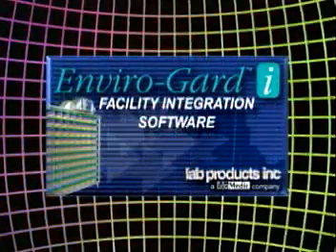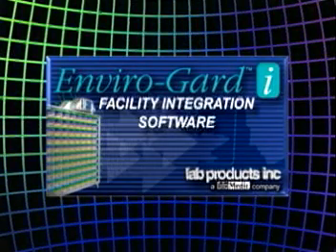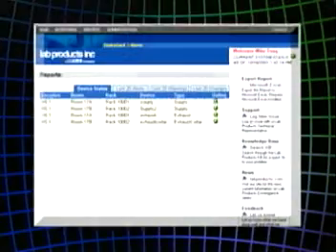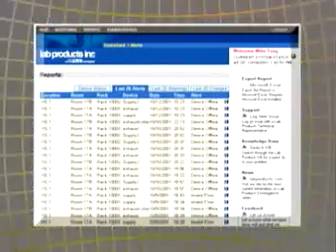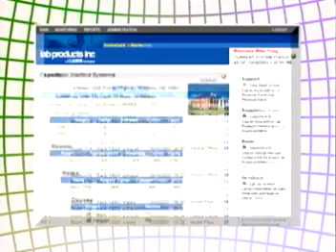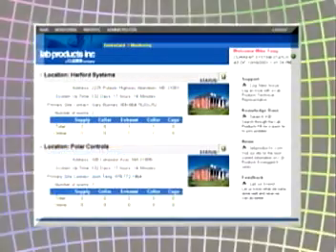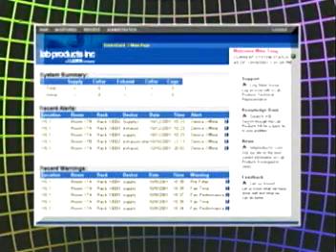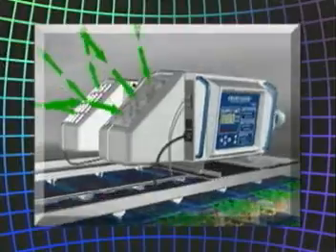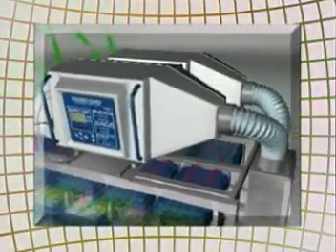EnviroGuard iFacility integration software is a simple web-based interface designed for managers who need reliable environmental control data on demand. Now you can monitor and interact with all your ventilated housing units in real time by remote computer. EnviroGuard i creates a world-class solution for remote environmental monitoring and control of all your high-density micro isolator housing.